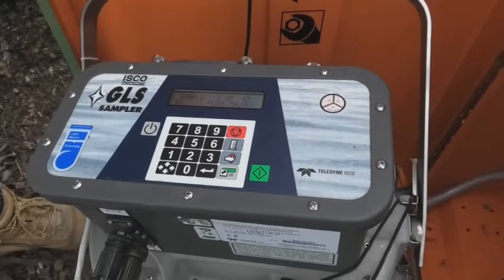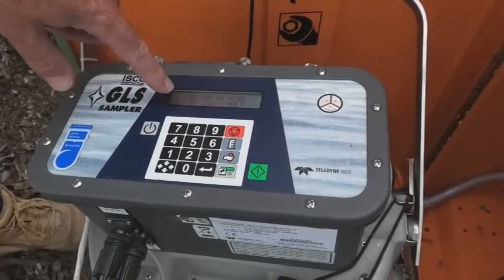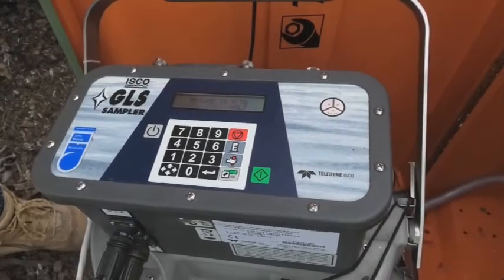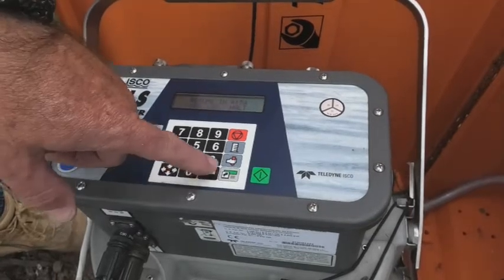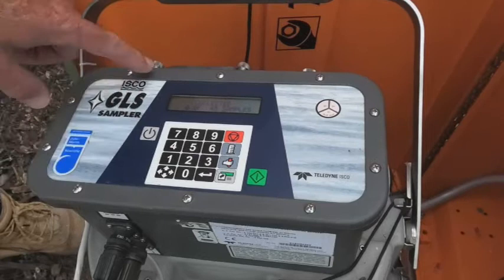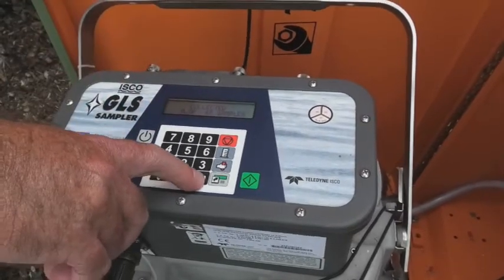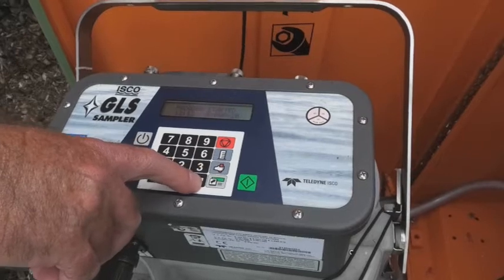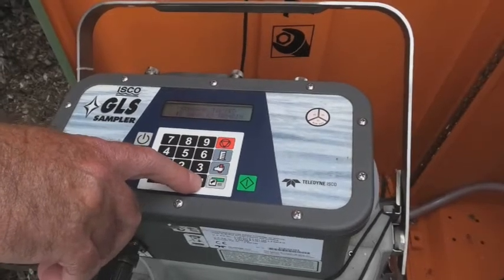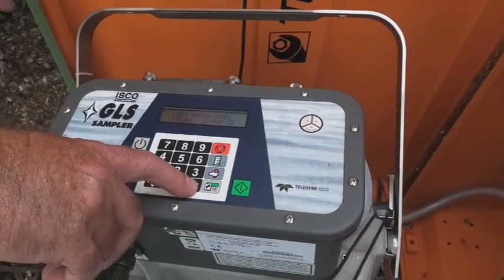So the first step in the process would be to hit the red HALT button, and it gives you an option to view the log or HALT. So in the first instance, if you've had a successful event, I would view the log and it would take you through — it'll tell you how many samples have been collected of your whole program, tell you when you turned the program on, when you paused it, and how many were left.